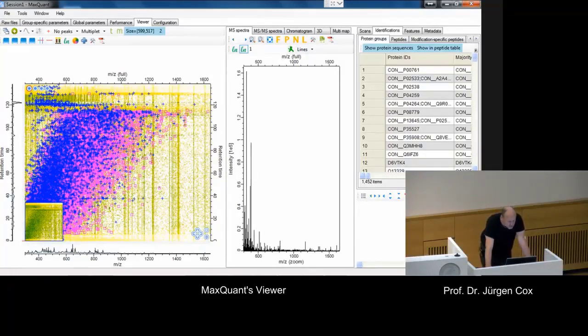And yeah, so for example, one can also select these points, and then one would have to go here to the selection mode. So that was zoom mode, move mode, here is select mode. And then you could, for example, select this guy here.